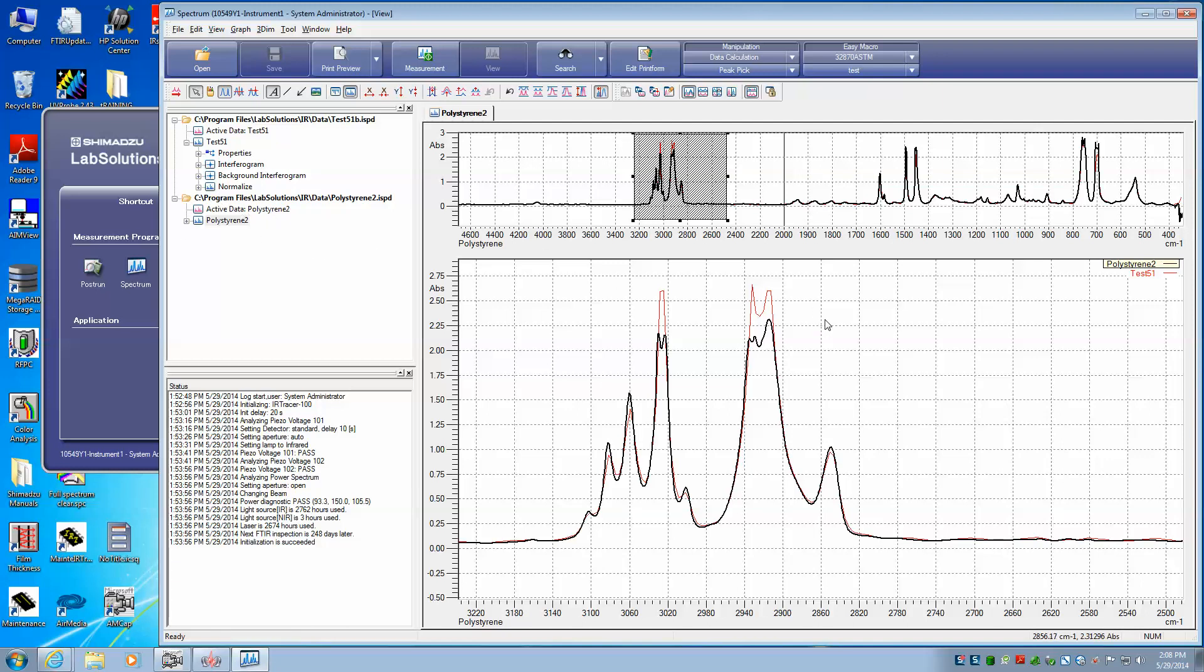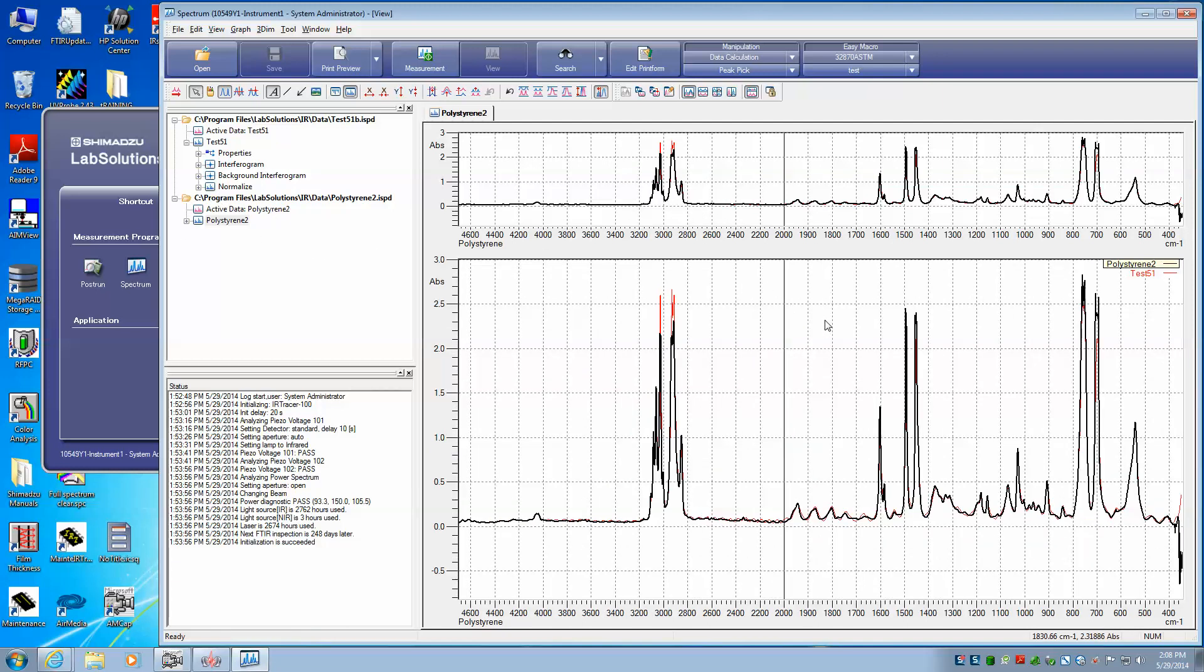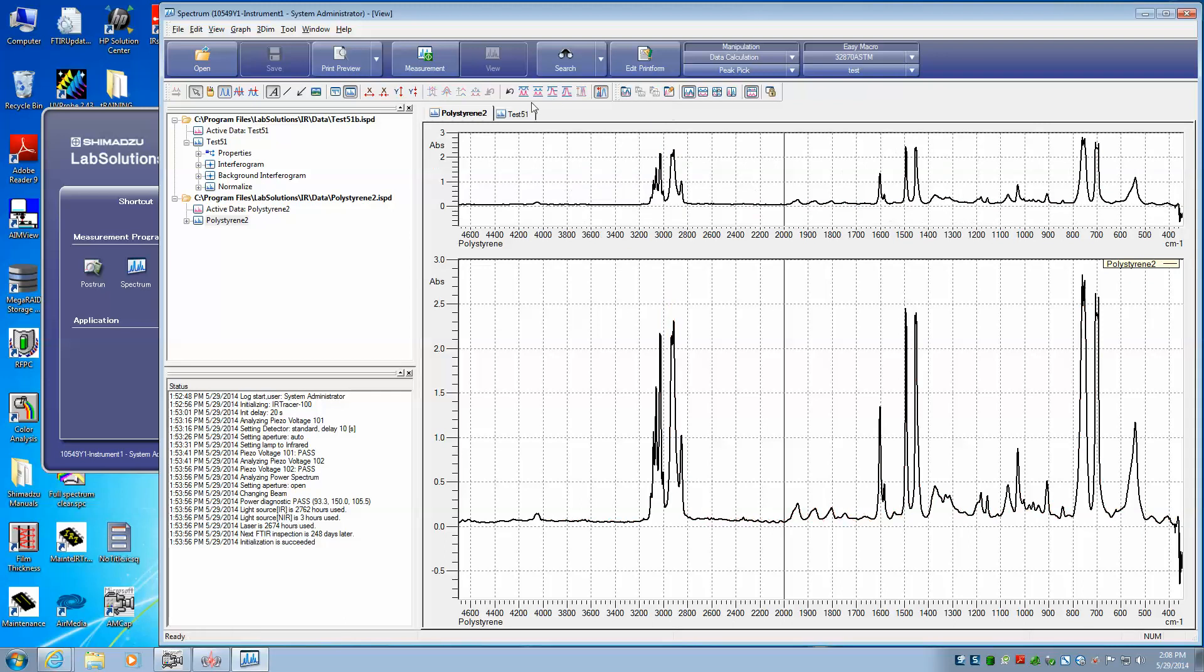And again, double left click takes us back to the beginning. And if we want to separate them, we would go back to this icon. Notice that our Join icon is now grayed out. We would go to this icon that splits all, and that splits the two individual files back out.